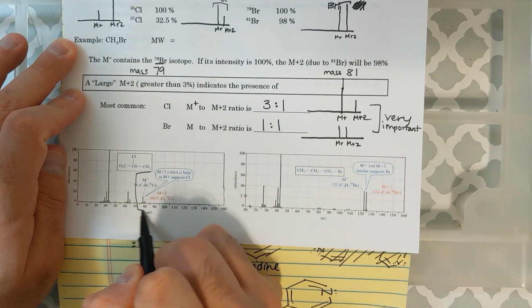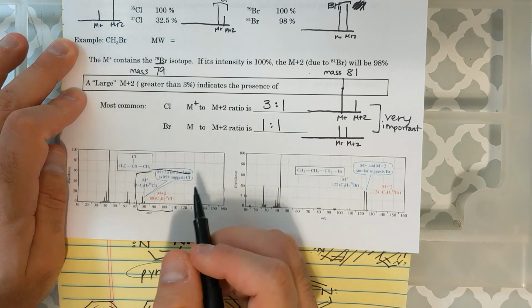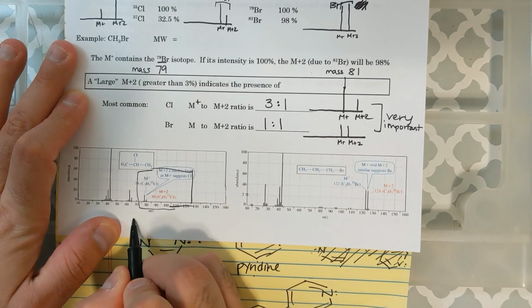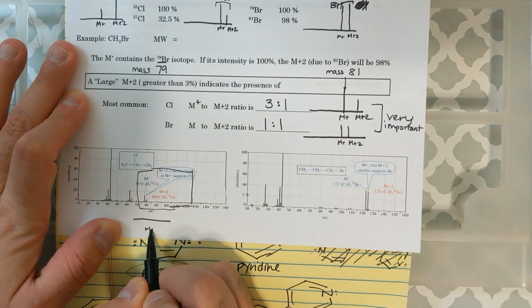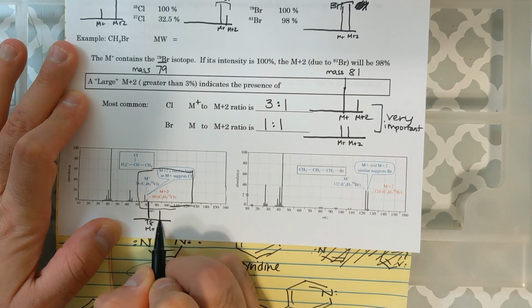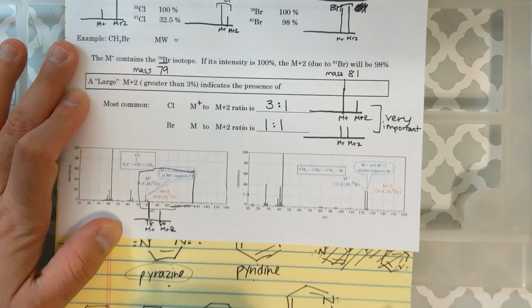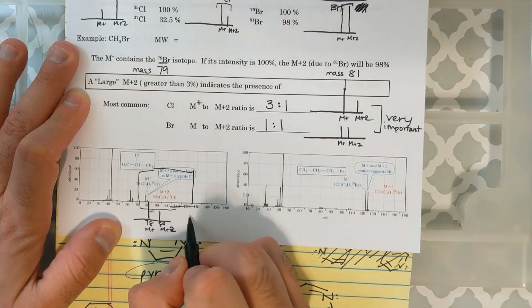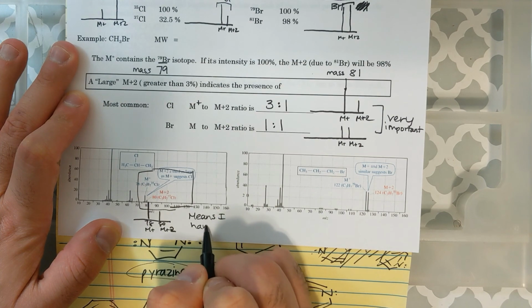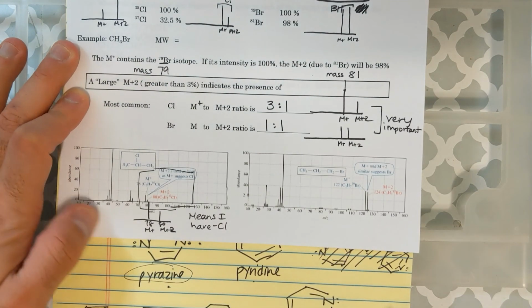So if you put kind of a box around here, this means I have chlorine in my compound. Again, if you zoom in, my M plus peak is a mass of 78, and that goes up a bit. And then my M plus 2 is a mass of 80, and it's about a third the height. This means I have chlorine, I have Cl in my structure.